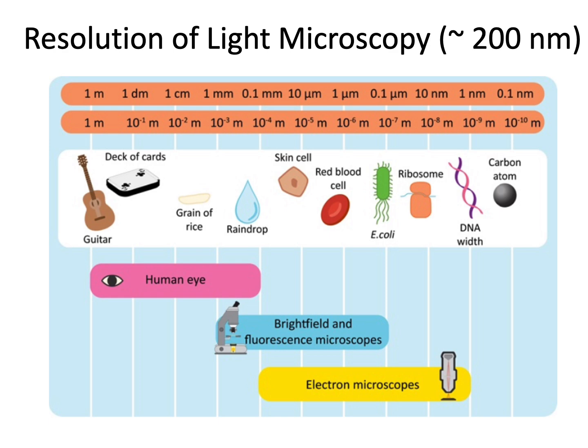Now, electron microscopes we'll look at coming up. They for sure can beat light microscopes in terms of powers of magnification and resolution. They can see much smaller stuff. But that doesn't mean they're only good for that. So there's overlap there, because they're also useful for seeing different types of structures that you can see with light microscopy too, just different types of information.